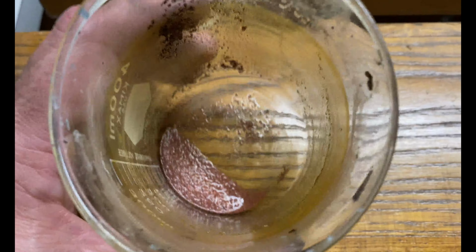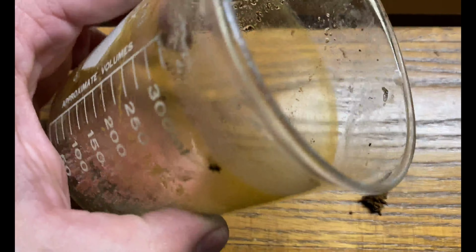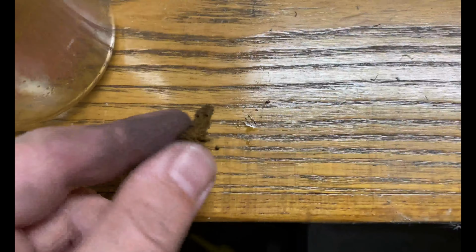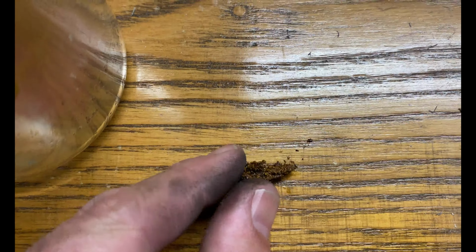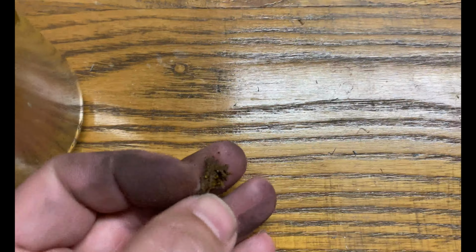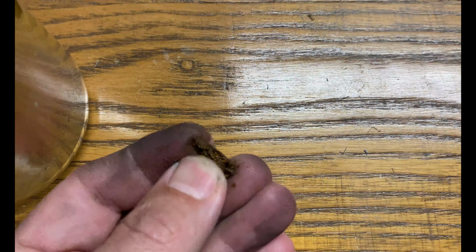Here's a comparison of the copper-coated steel that didn't have a magnetic field. As you can see, it's not cohesive at all, and if it dries, it's just going to be a powder again. But the copper-coated iron that was exposed to the magnetic field took on a solid form and retained some of the magnetic field lines in its shape, and it's quite a bit stronger compared to the other one. I mean, it's not strong as metals go, but it did form a cohesive lump there. Even got a little bit of strength to it. So I think we're onto something.